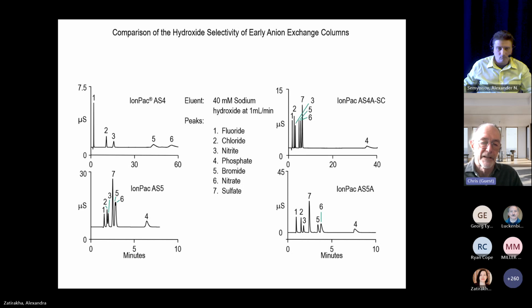And that means in a highly hydroxide-rich stationary phase, they can be in equilibrium with a zwitterionic state where you have a quaternary ion exchange site and an ionized hydroxyl group. And that's what gives hydroxide more elution power than it otherwise would have on an aliphatic phase.